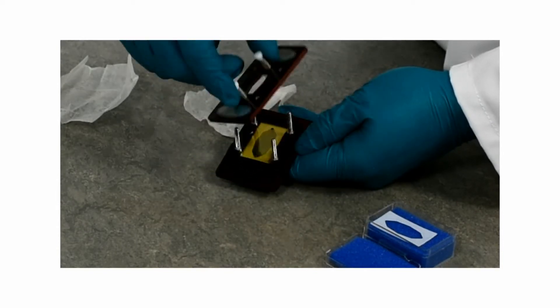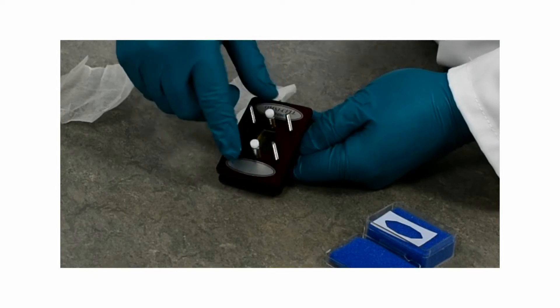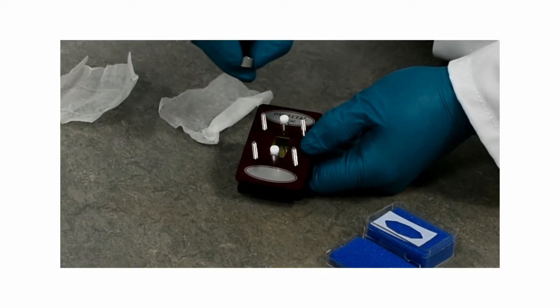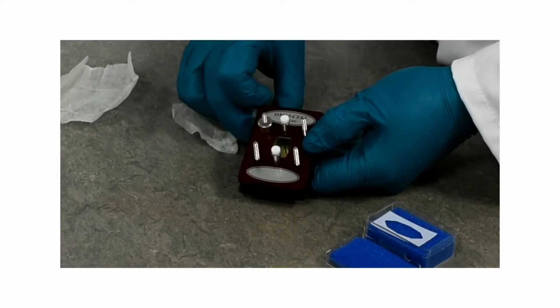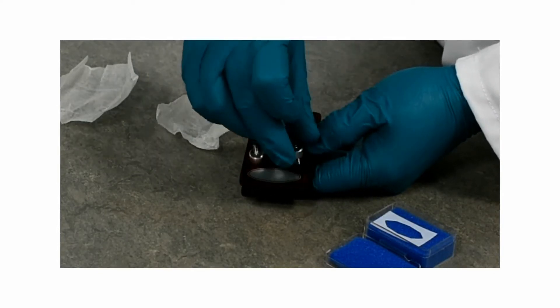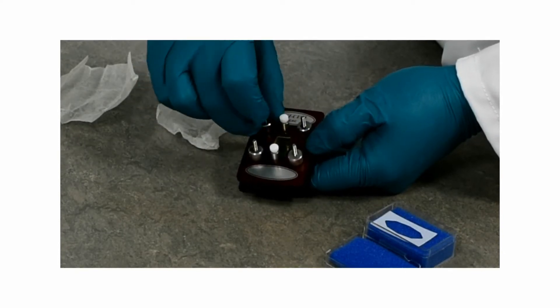You then take the front of the omni-cell and simply insert it onto the omni-cell. You then have some clever little nuts that you can drop on — it takes a couple of seconds to drop them on — and then you can simply tighten them up to secure your omni-cell.